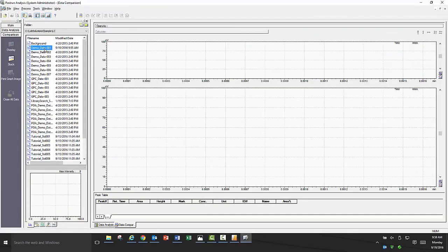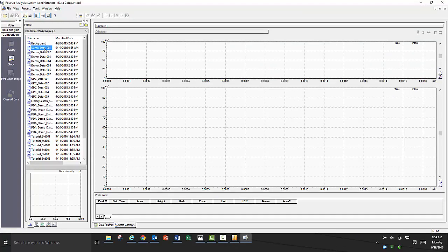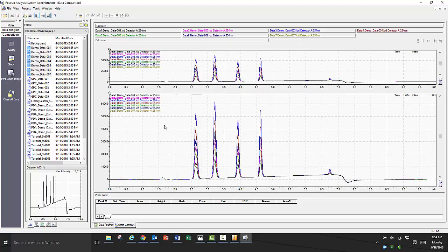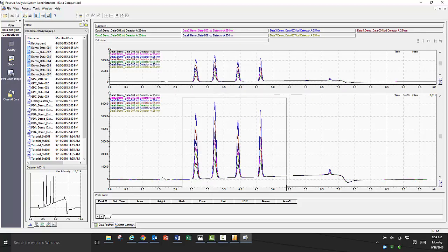Now that you are in the correct project folder and your data files are visible, you can select as many files as you would like to compare by dragging and dropping them one at a time or using left mouse click and shift or left mouse click and control to select multiple data files and then drag them into the data comparison window.